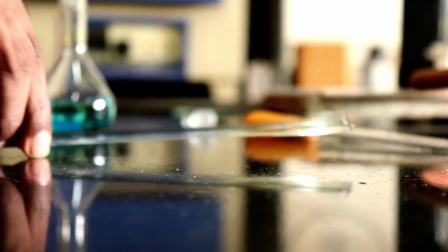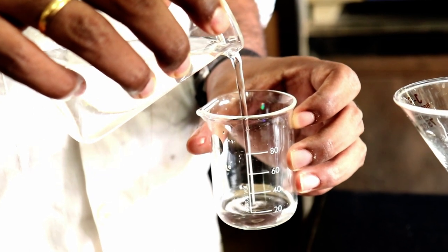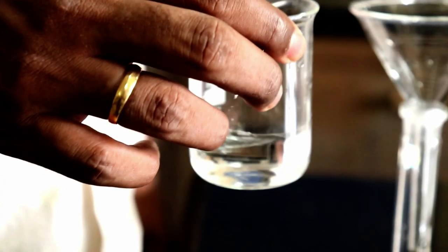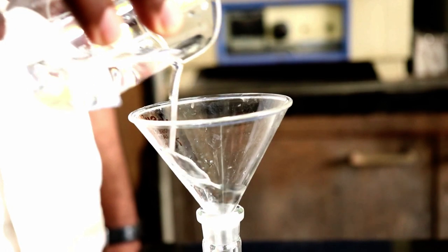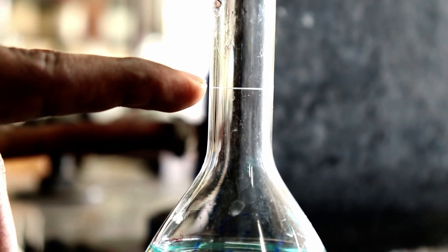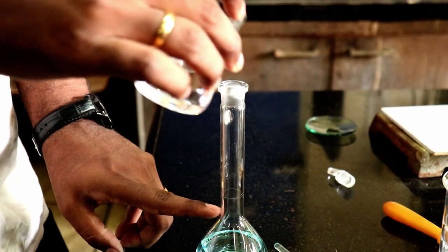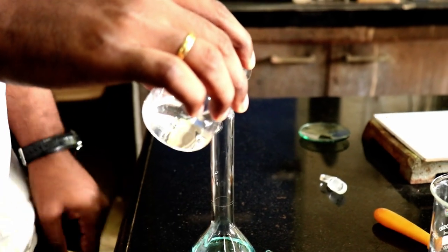The use of glass rod is over. Pour some water into the beaker, swirl it and wash the funnel. This is the calibration mark for the standard measuring flask. You need to fill the solution till here. Put some water till here directly from the beaker.